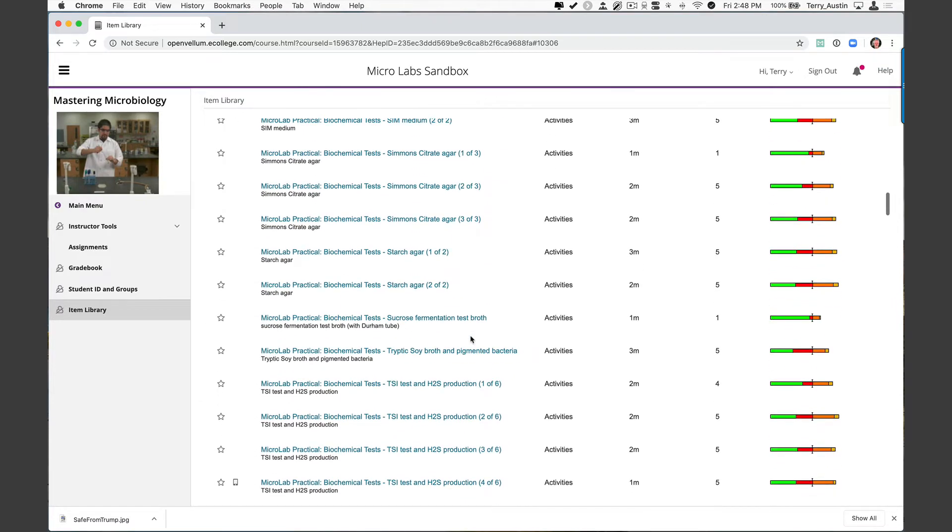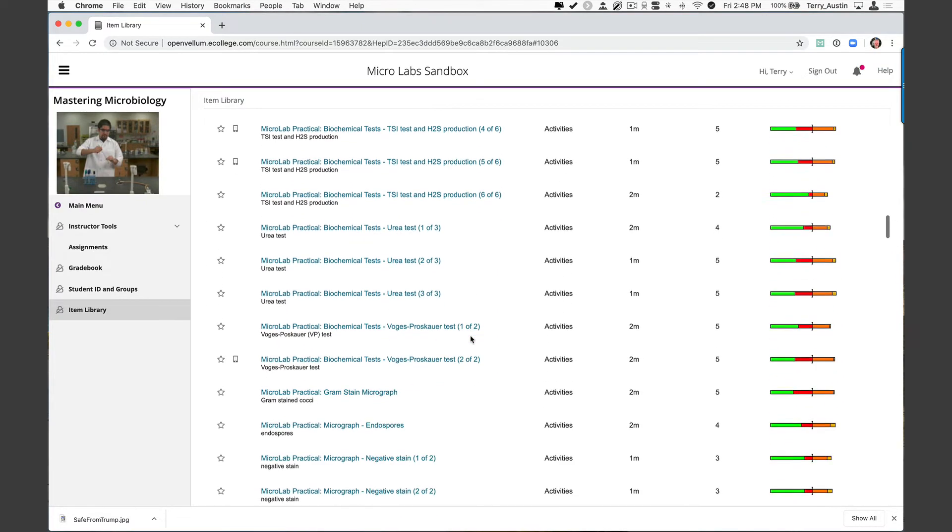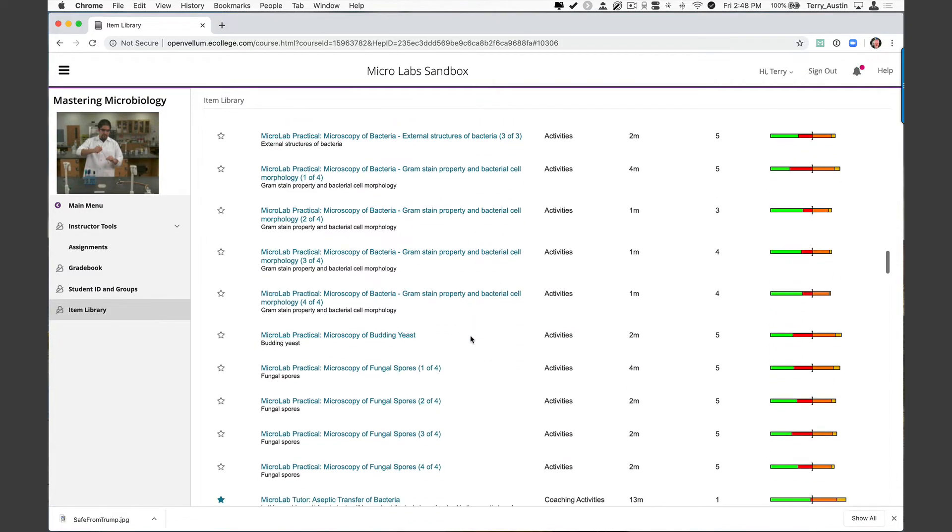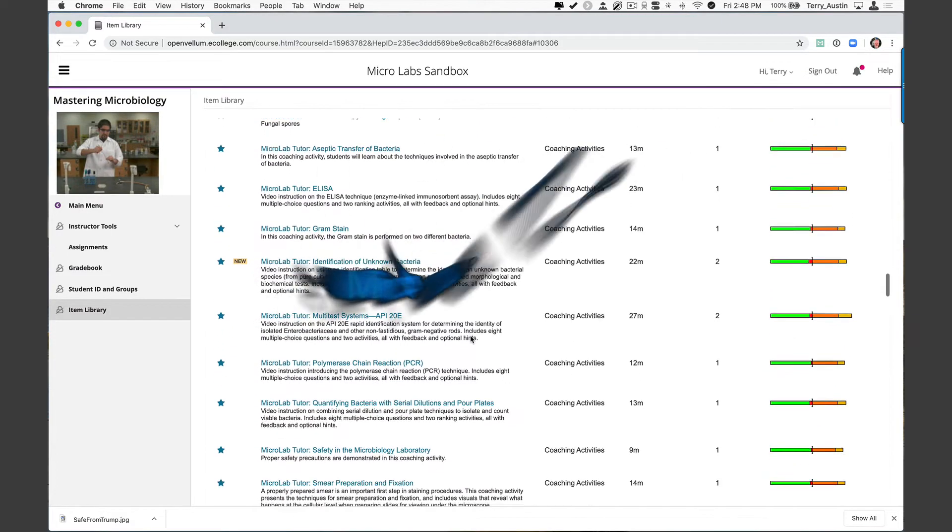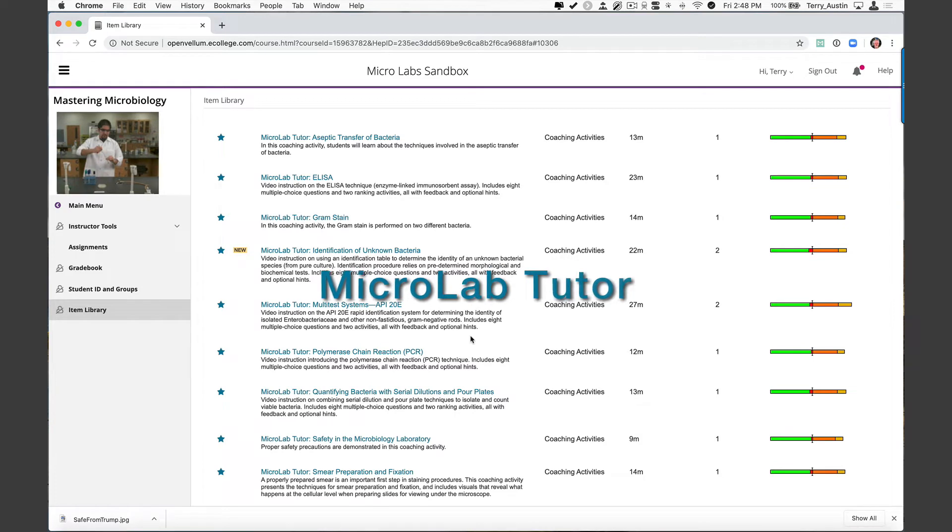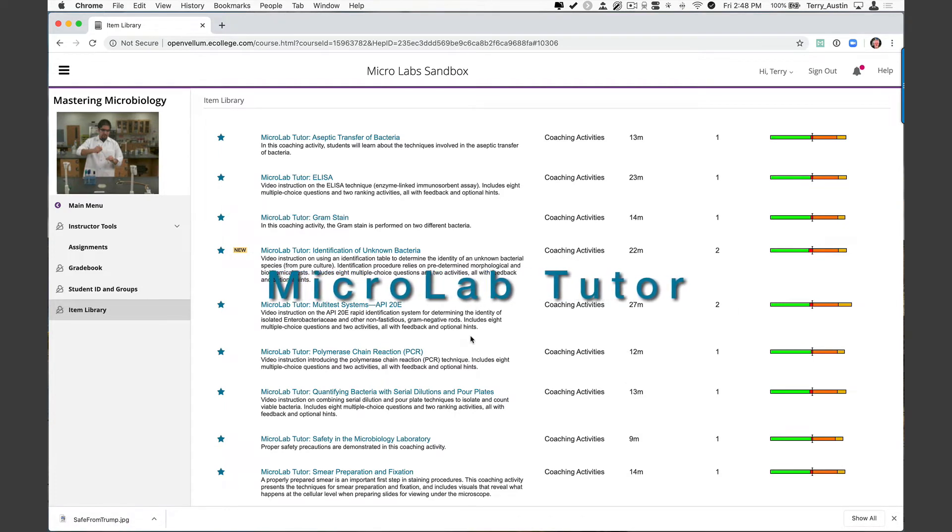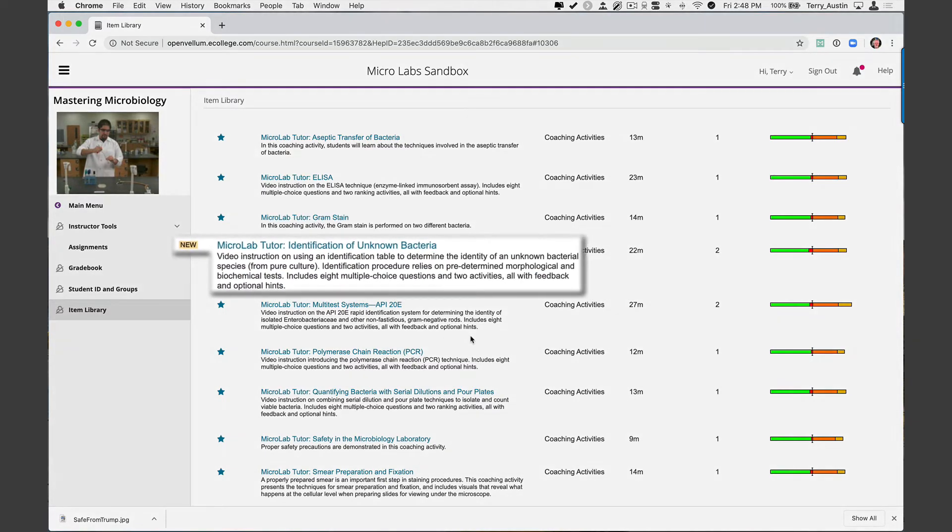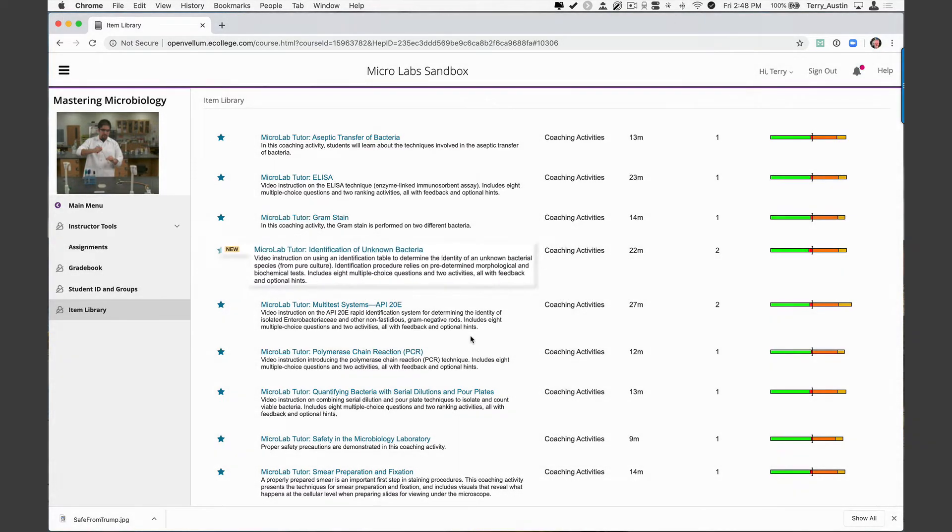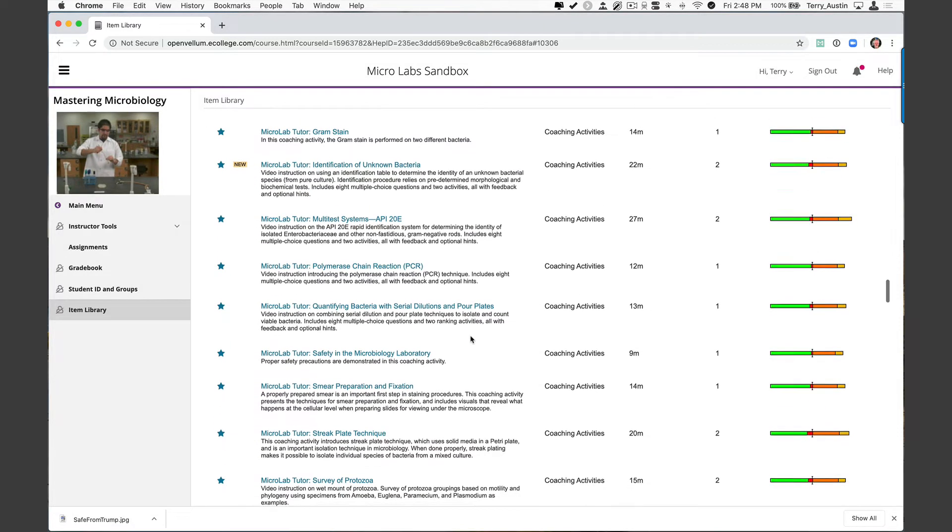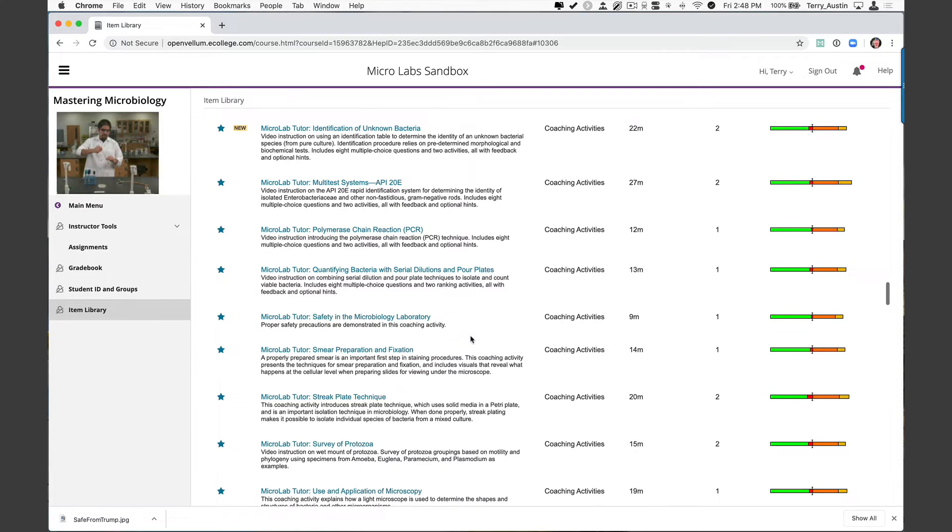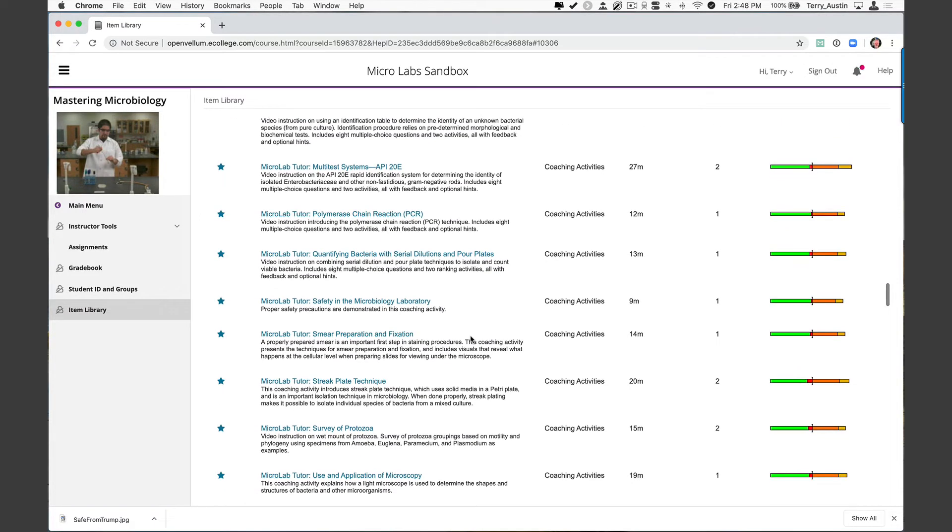We're going to keep on scrolling through this nice long list until we find some of my favorites that actually have stars by them. And there they are. Some of my favorites: micro lab tutor aseptic transfer, ELISA, gram stain, identifying unknowns. Now you didn't expect that one, but it's right there. Multitest system API 20E, PCR, quantifying bacteria with serial dilution and pore plates. There's really some great stuff in here.